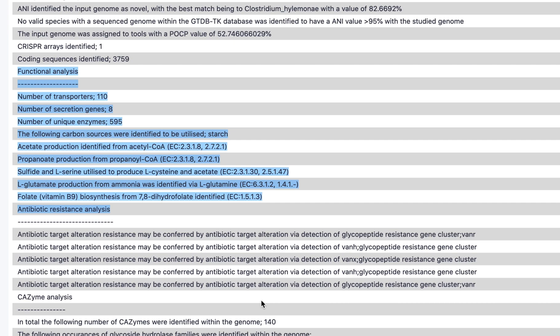Pathway analysis, based on KEGG, includes the predicted production of short-chain fatty acids and vitamins such as folate.